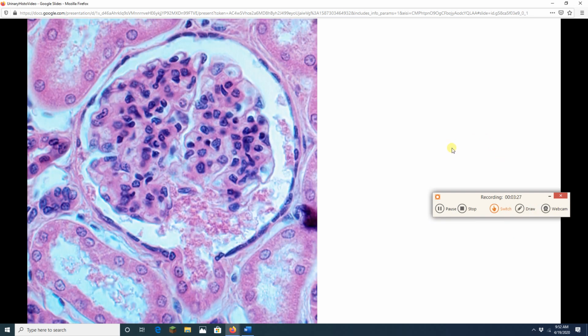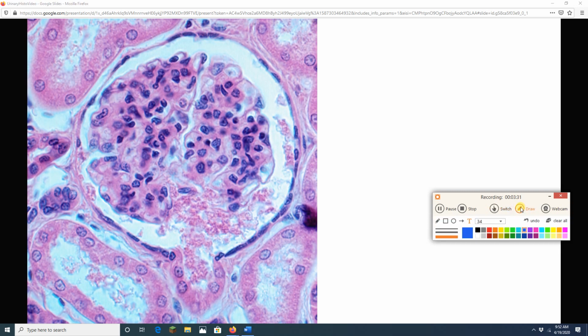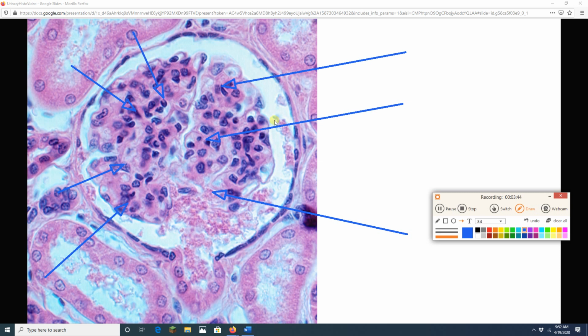And we got another view of the same thing. It's just a different one, okay? So I still have the renal cortex here. I can still see a glomerulus. This big round thing that I'm putting lots of arrows on is a glomerulus. It's made of fenestrated capillaries. It has podocytes sitting on it to help with the filtration.